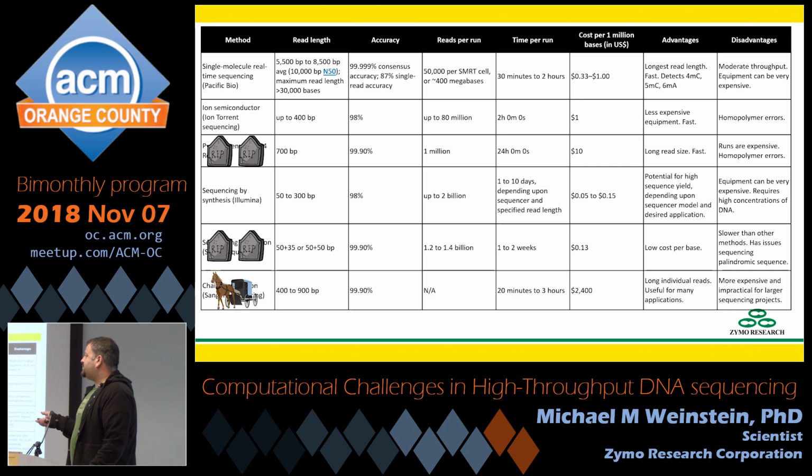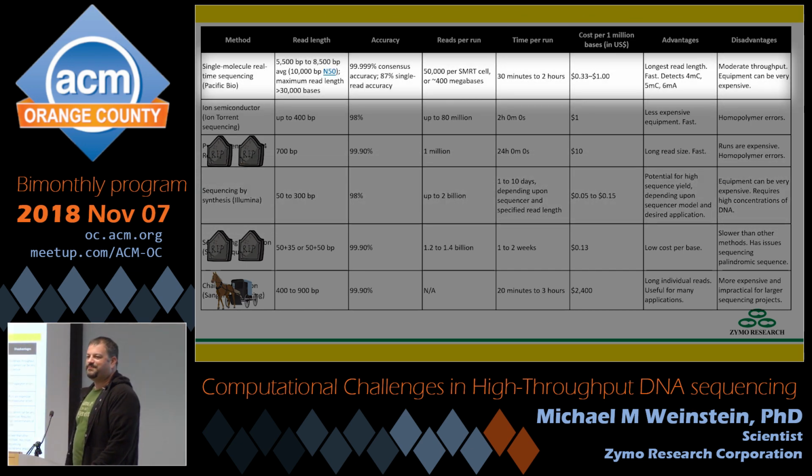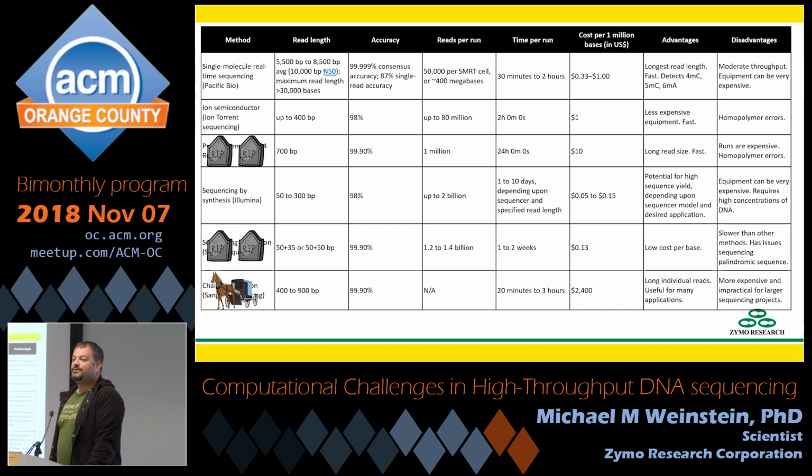Illumina sequencing by synthesis, and by the way, these guys, Illumina, just bought these guys, PacBio. So, do you have a question? Oh, okay. So the space is kind of interesting, but it seems to generally stay pretty consolidated around Illumina.